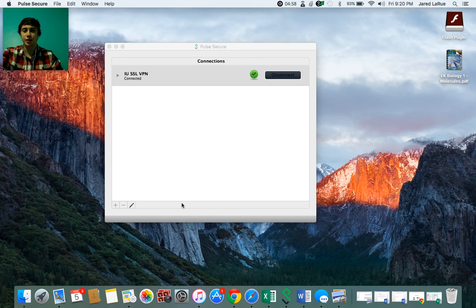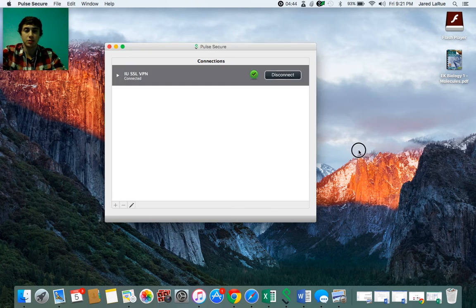My name is Jared, and today I'm going to show you how to use a program called Juno's Pulse to connect to a program called Codon Code to edit your DNA sequence samples that you have, or your DNA that you've sequenced, to find out what you actually have, what the nucleotides are.